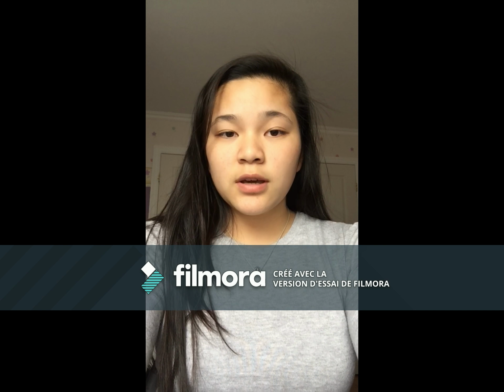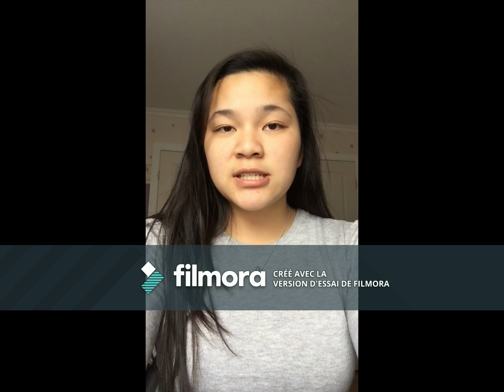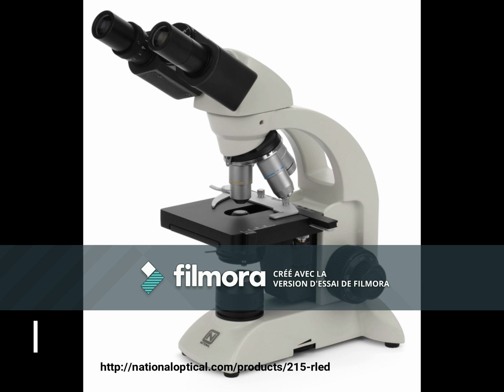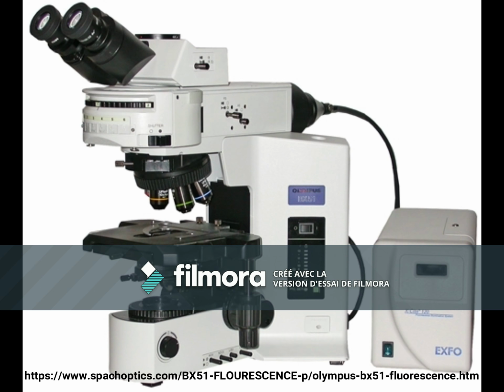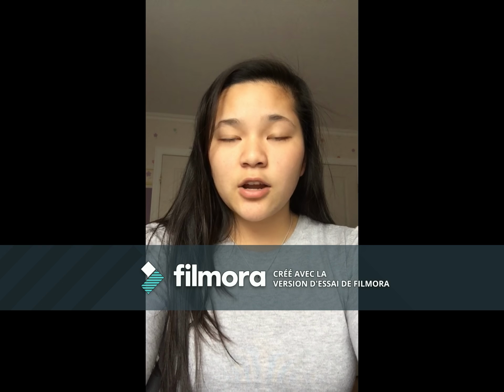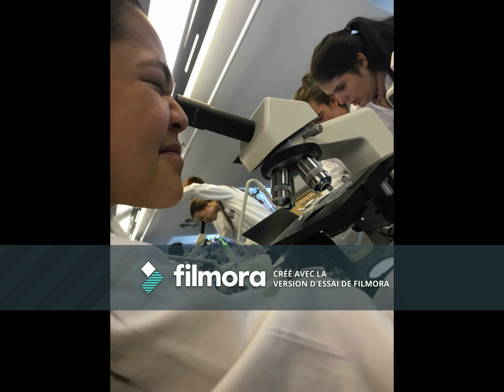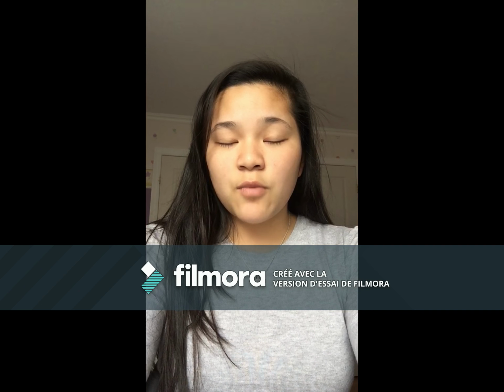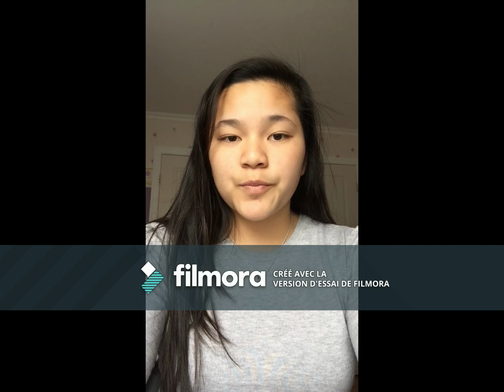Today, we viewed yeast cells and microalgae cells using both optical and fluorescent microscopes. The goal was to identify various organelles and observe fresh cells. In this part, I improved the method I was using to focus the microscope.